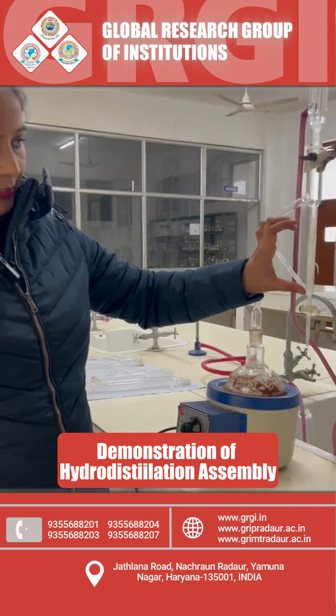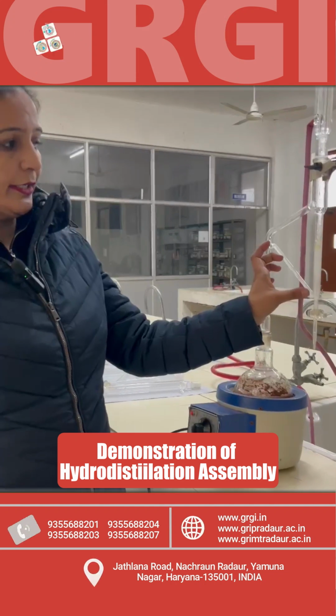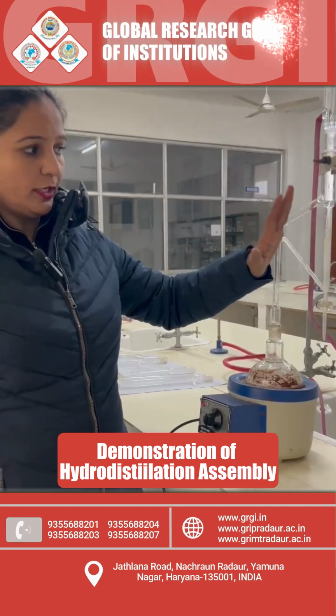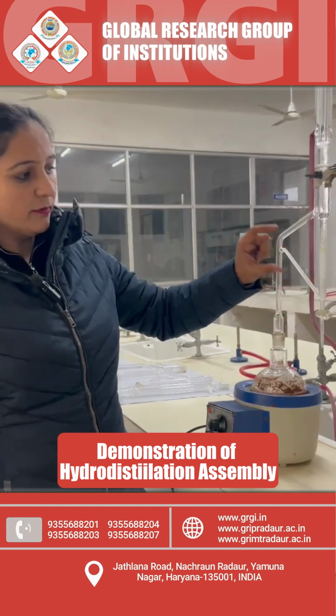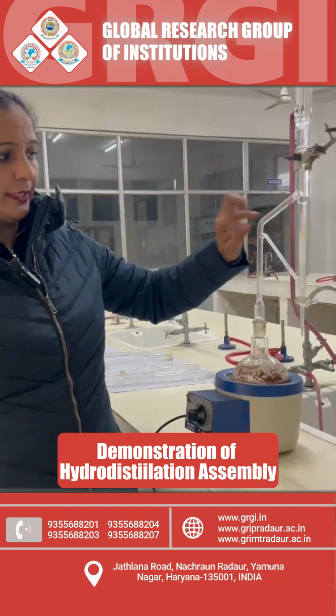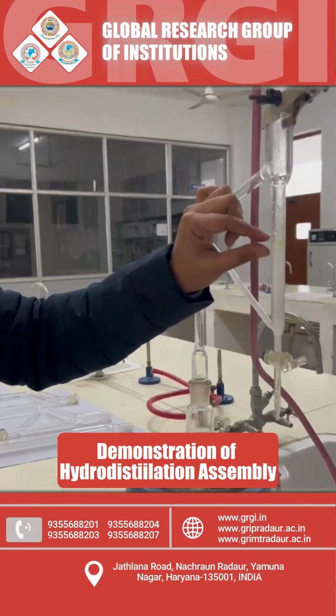As the level of water rises inside this graduated tube, it also rises in this tilted tube. As we know, the volatile oil and the water are immiscible with each other, so they form separate layers. As the volatile oil is lighter than water in this case, it will form a layer on the top.